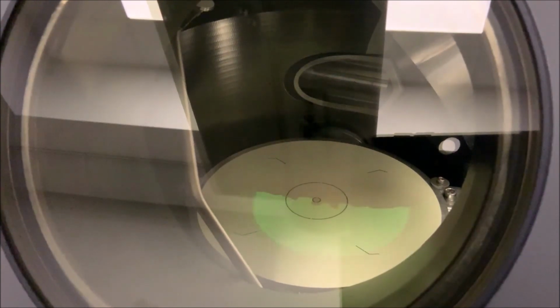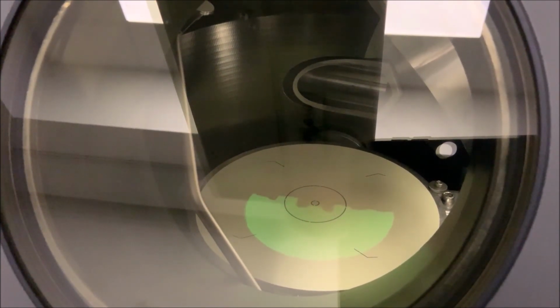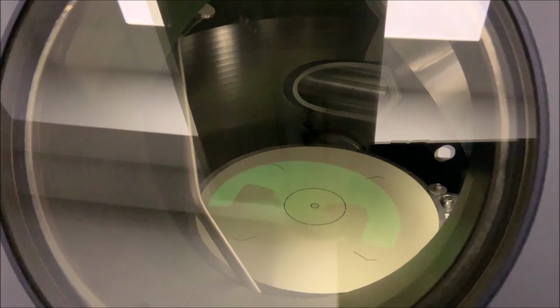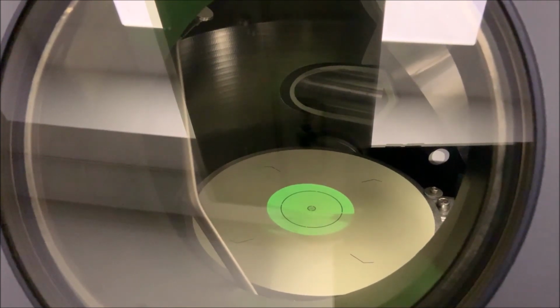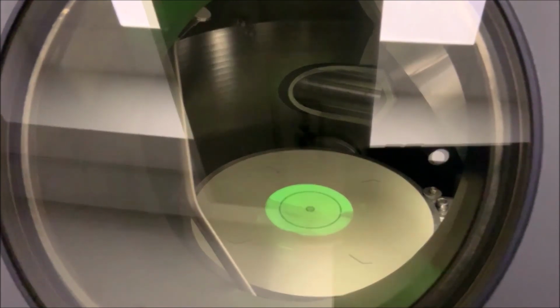Once the area of interest has been centered on the viewing screen, use the magnification knob on the right-hand panel to set the microscope into SA mode. As the magnification is changed, use the joystick to recenter and reposition the specimen as needed. Use the trackball and intensity knob on the left-hand panel to recenter and resize the beam as needed.